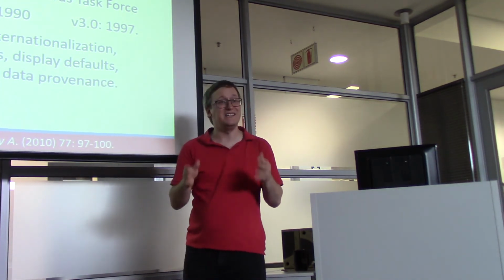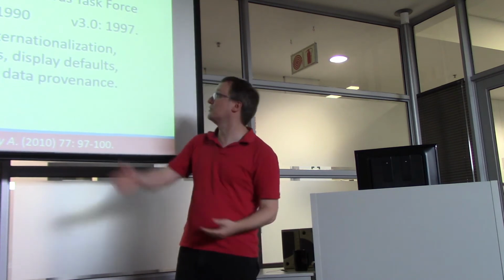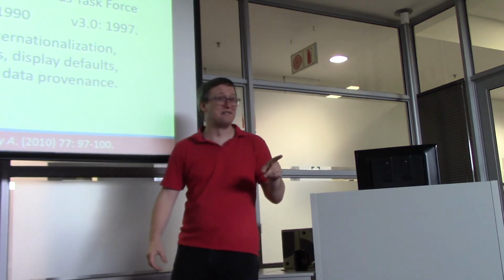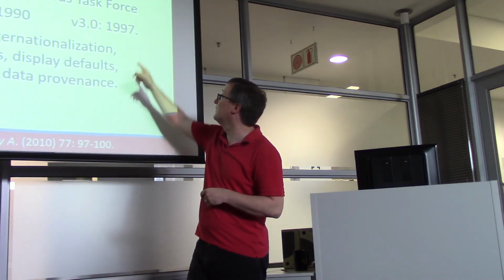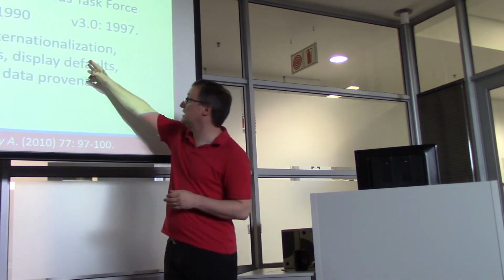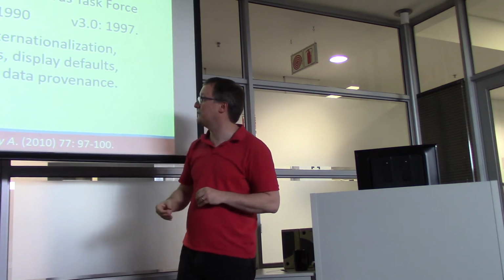So back in 1984, this field was already coming to the consensus that we need to have a standard way that we can communicate flow cytometry data to each other. And so they created the first file format for this in 1984. Six years later, they were already updating this format to its version 2. Version 3 was introduced in 1997. And these days they're up to version 3.1, and they've done quite a lot to make these files usable in different continents, on being able to store how compensation should be conducted, how we should visualize these data by default.